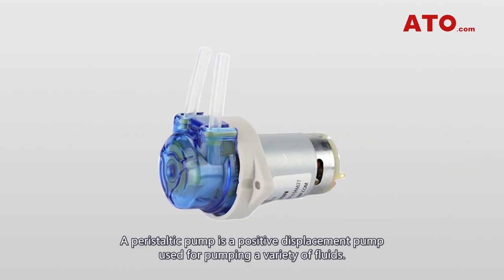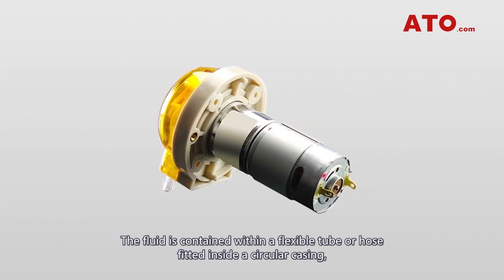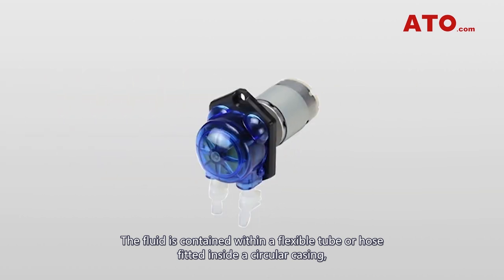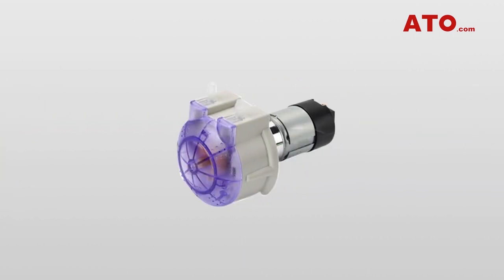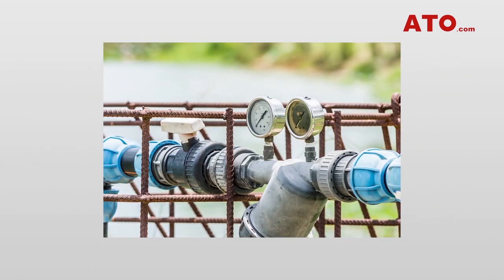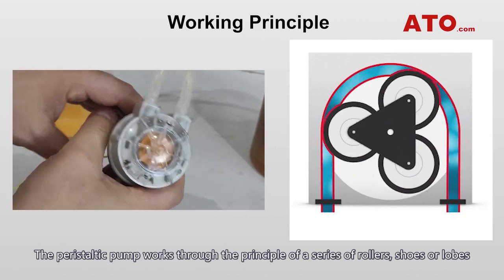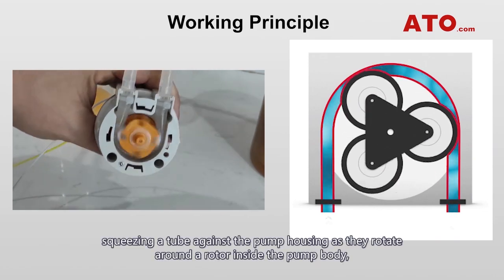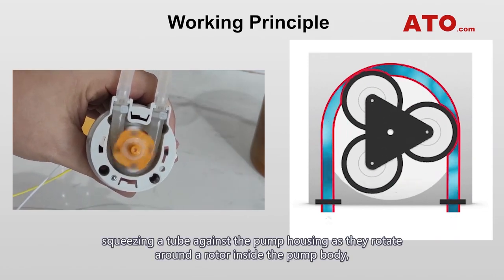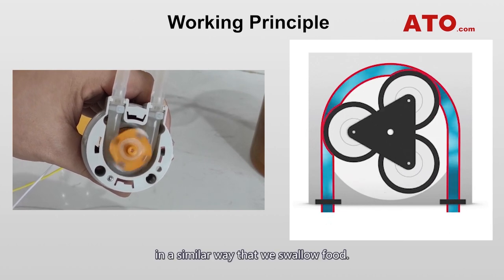A peristaltic pump is a positive displacement pump used for pumping a variety of fluids. The fluid is contained within a flexible tube or hose fitted inside a circular casing, therefore also referred to as a tube or hose pump. The peristaltic pump works through the principle of a series of rollers, shoes or lobes squeezing a tube against the pump housing as they rotate around the rotor inside the pump body, in a similar way that we swallow food.